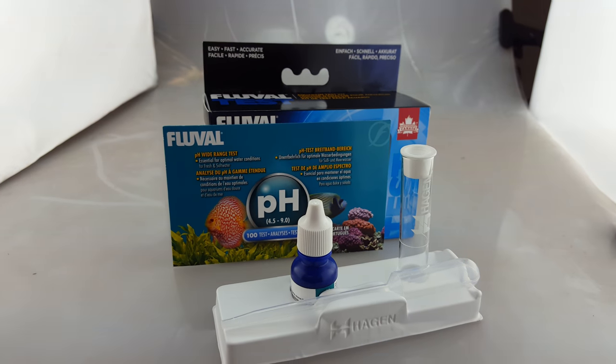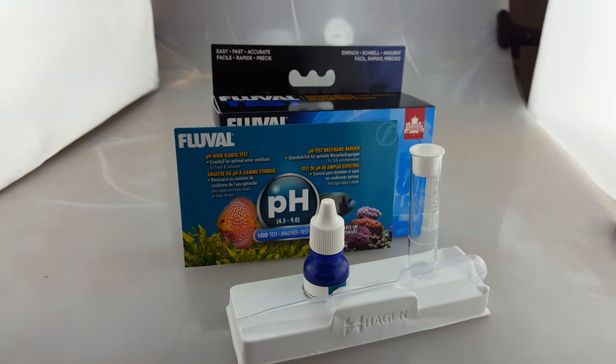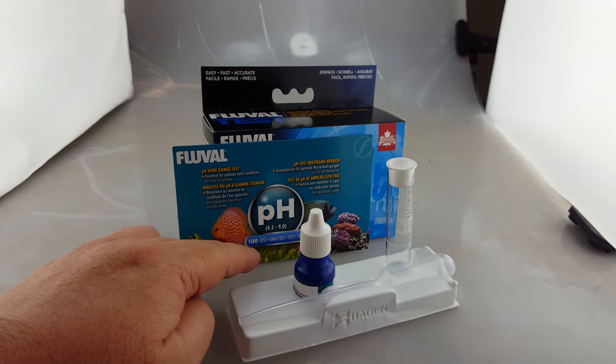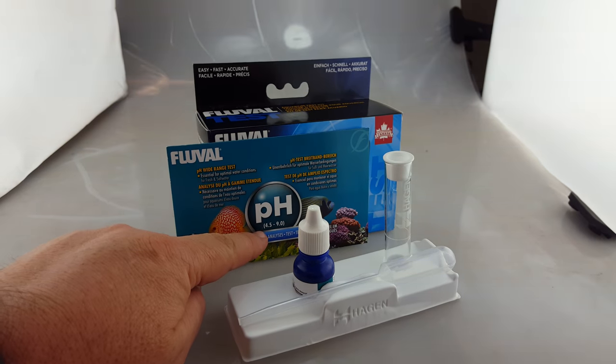We've got the new Fleville test kits. This is the pH test kit. The pH test kit is 100 tests and it will work from a range of 4.5 through to 9.